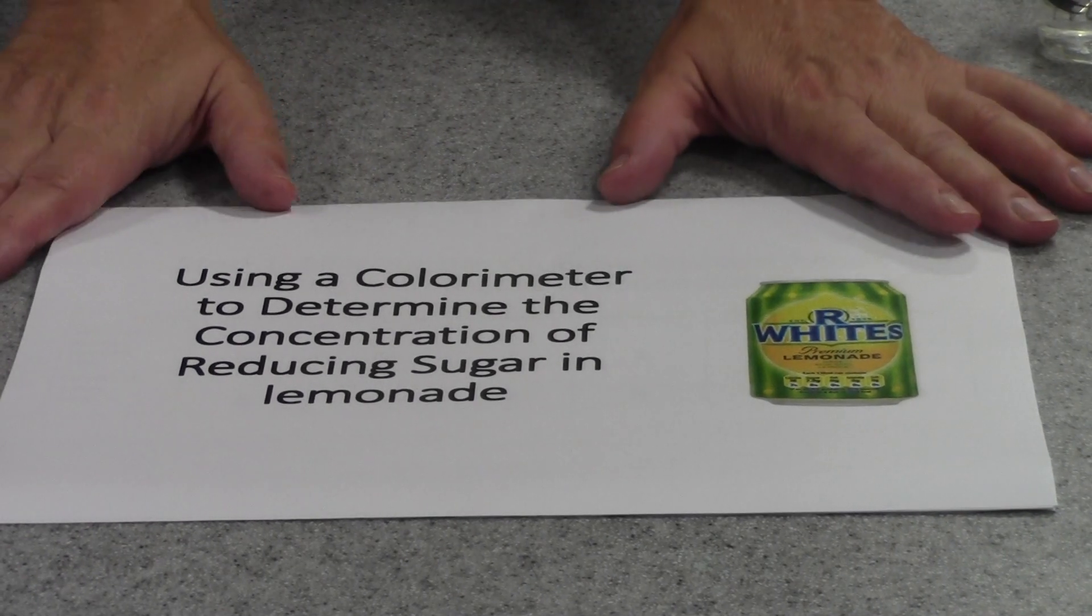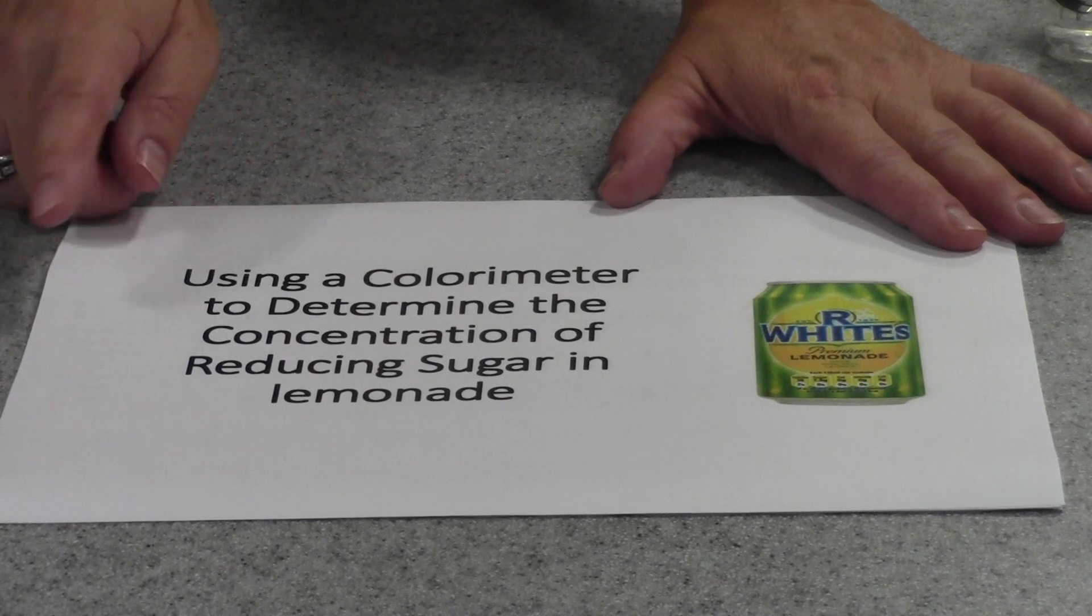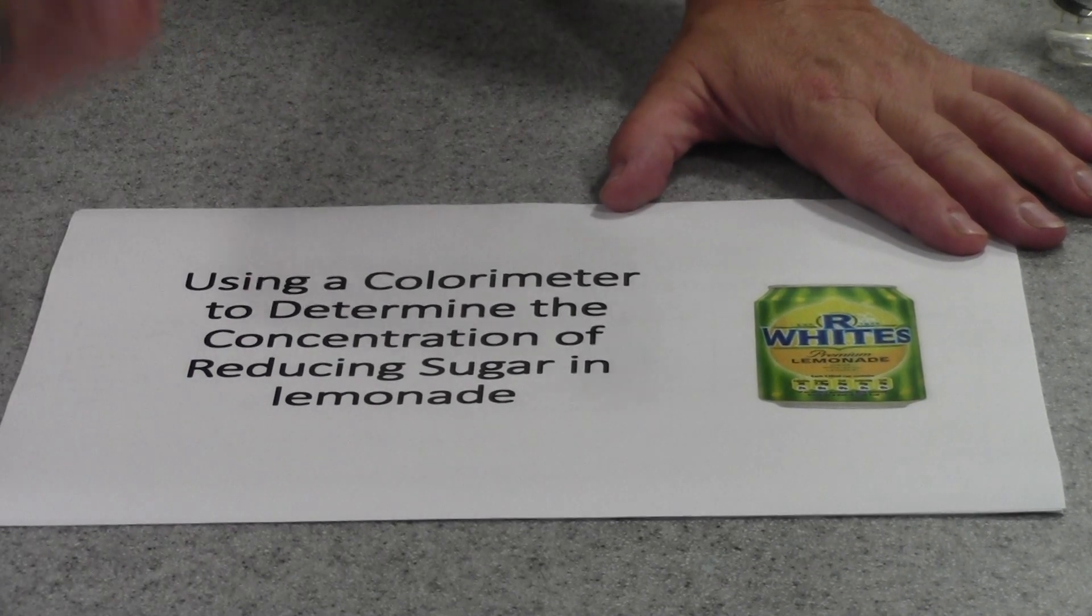I'm going to show you a method that involves using a device called a colorimeter to determine the concentration of reducing sugar in lemonade.